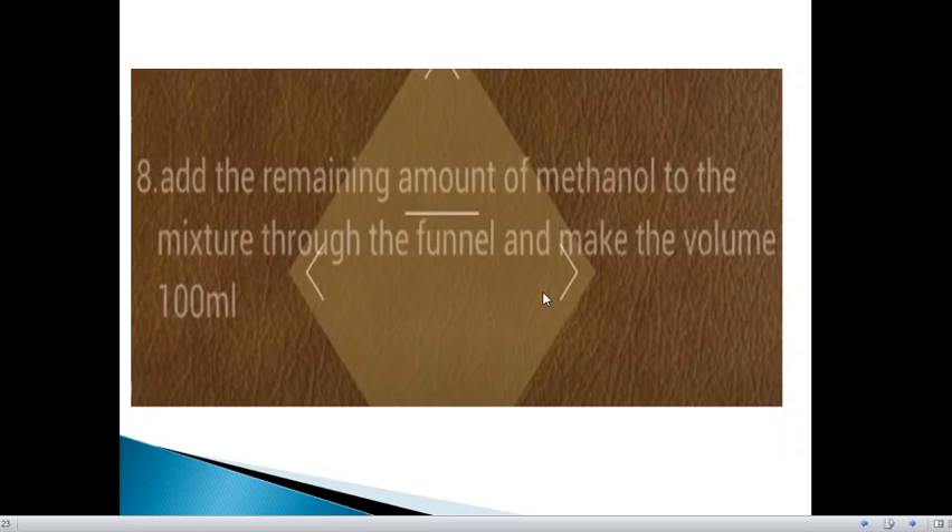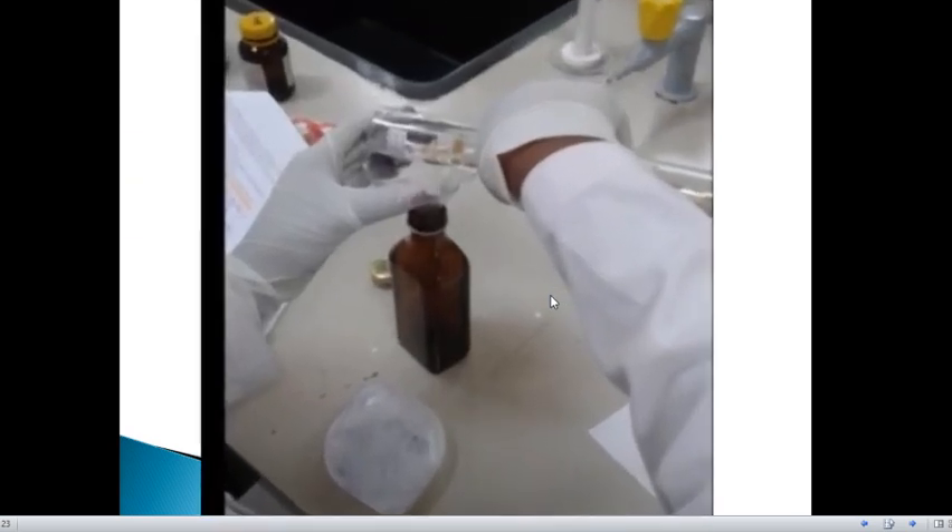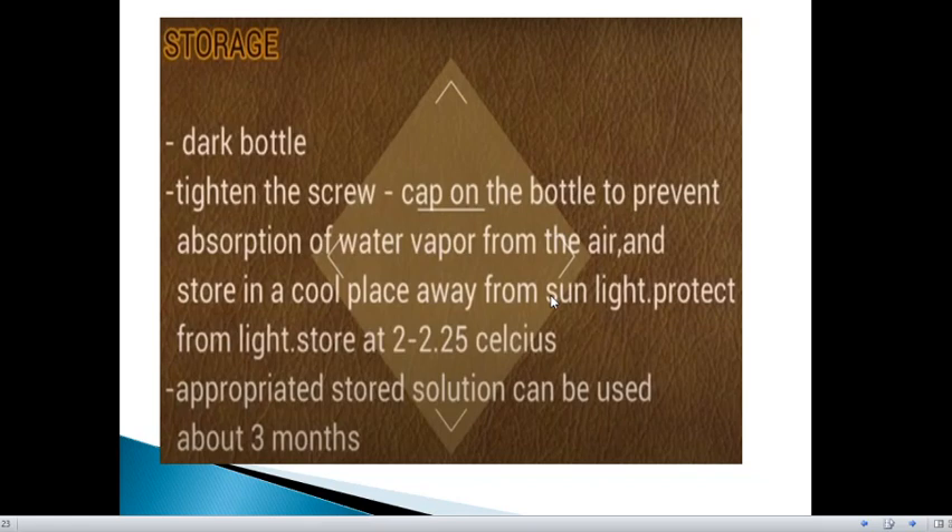Now add the remaining amount of methanol to the mixture through the funnel to make the total volume 100 ml. For storage of this solution, use the dark bottle as discussed earlier. Tighten the screw cap on the bottle to prevent absorption of water vapour from the air, and store in a cool place away from sunlight, protected from light.